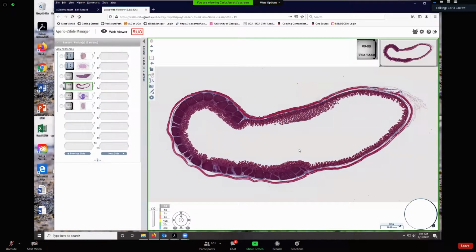Okay, down in the small intestine, we have gut-associated lymphoid tissue down there too. Now, in neonates of some species, ruminants, carnivores, and pigs, these Peyer's patches, true Peyer's patches, form in the neonate, and that is where B cells differentiate and mature. So that would be a primary lymphoid organ in the neonate, along with the thymus.